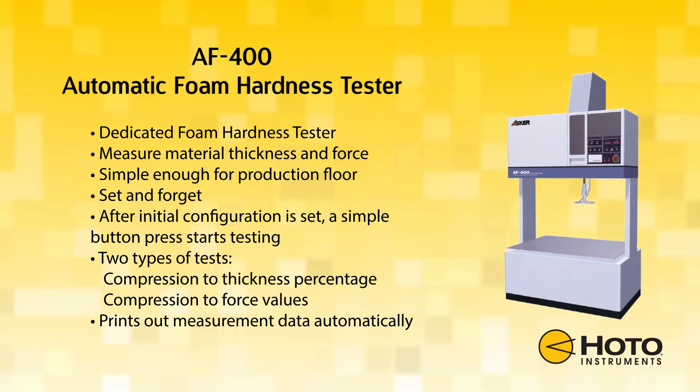Two types of compression tests can be conducted with the AF400. The first compresses the sample up to three different thickness percentages, recording the force. The second compresses the sample up to two preset force values, recording the thickness.